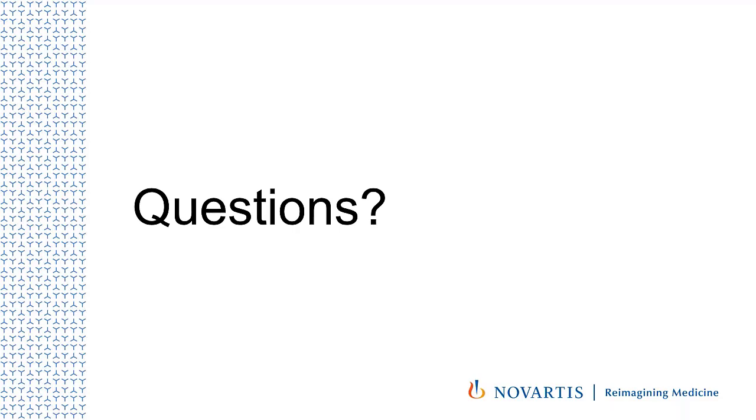There's another one. Could you please comment on the possibilities of the spectra deconvolution tool? Is it possible to deconvolute non-resolved isotope envelopes from a SQ?